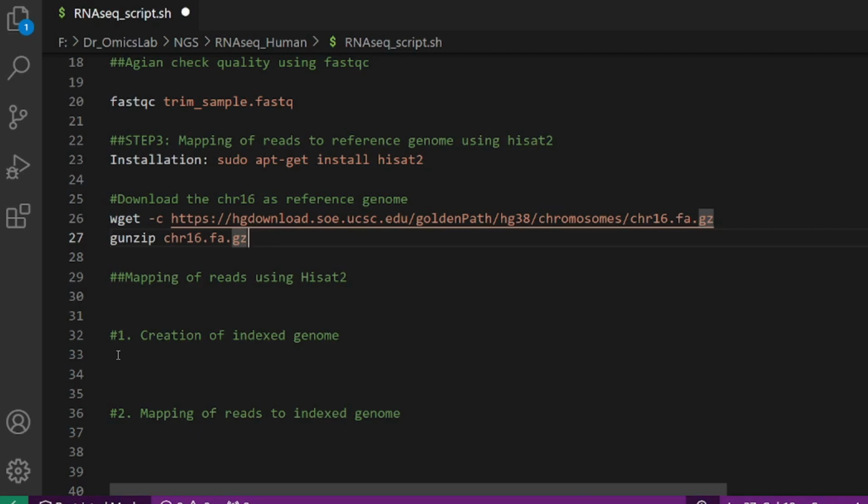As we are dividing the reference genome into small files in a binary format, the tool can understand the binary language very easily, and it will increase the speed of mapping. The use of indexing is just to increase the speed of mapping.